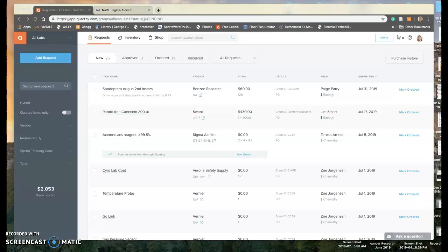So this video will be the first in a series of learning how to use the more advanced functions of Quartzy besides just searching for items in our inventory. So the first thing is how to request an item. So if a professor, or Teresa asks you to request an item, this is how you would do it.